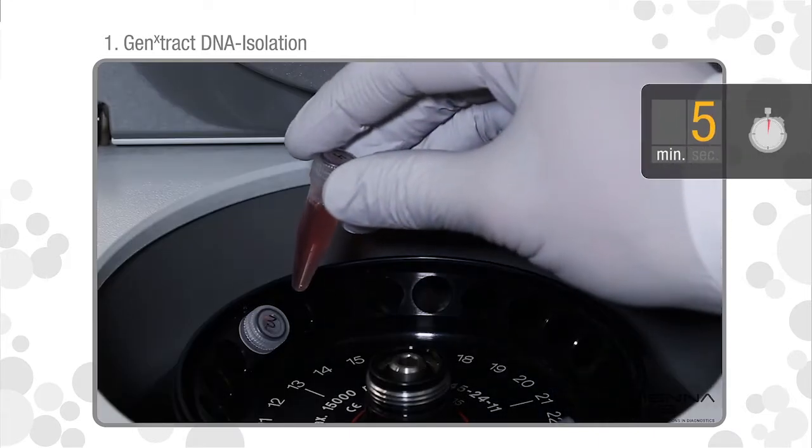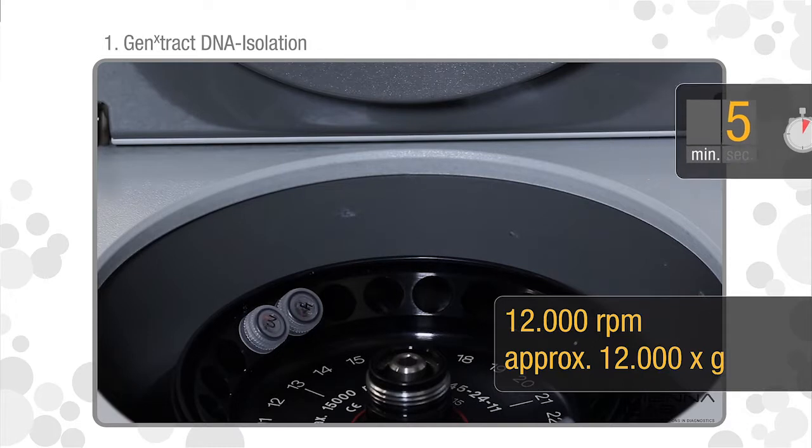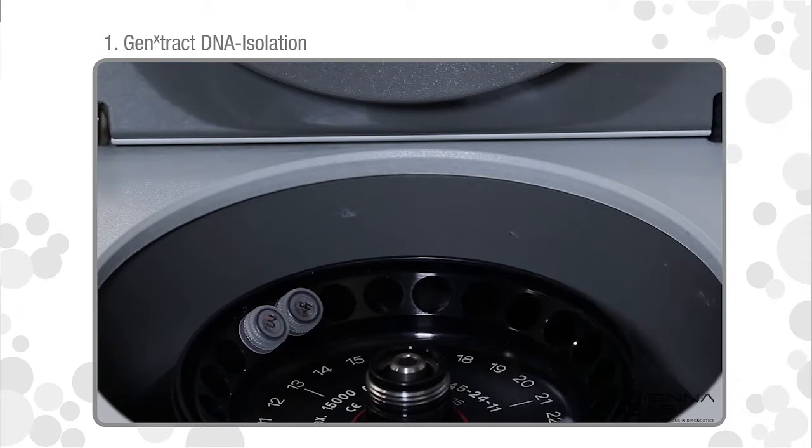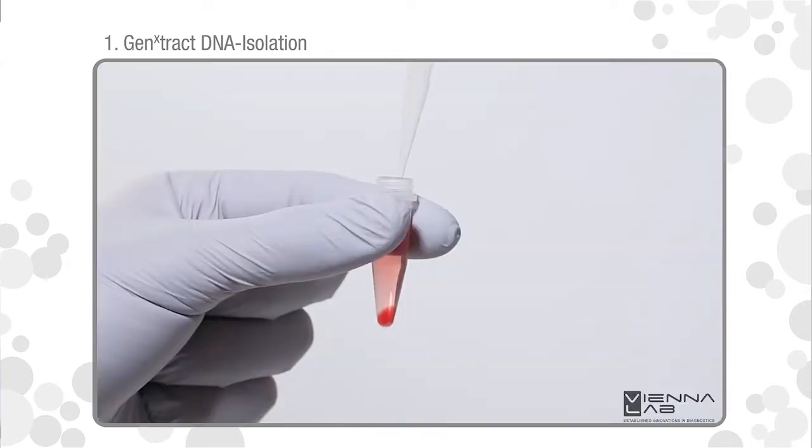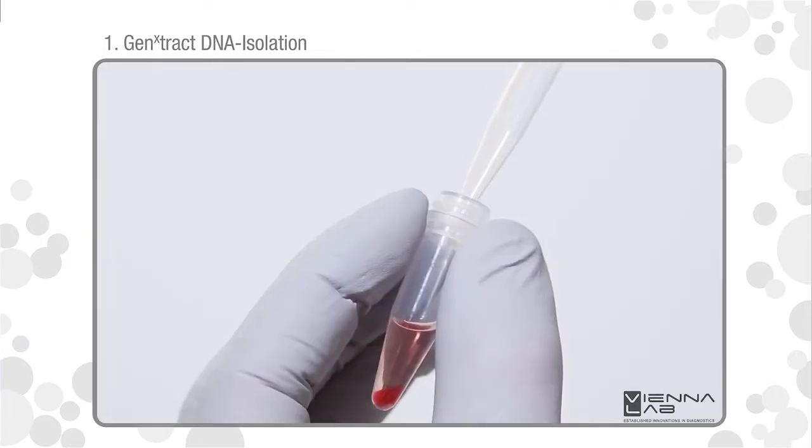Centrifuge for 5 minutes at 12,000 RPM in a micro-centrifuge. Remove and discard the supernatant except for approximately 50 microliters of visible soft pellet.